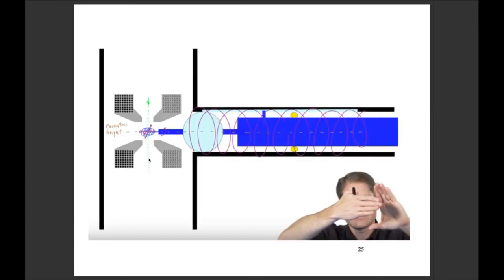Inside of here, he talks about the eucentric height, and that's the height at which, independent of the stage tilt, there is no image shift. The image does not move anymore. And so each sample has a unique eucentric height that can actually vary within the same grid itself. So within the same grid, from square to square, bouncing around this 3 millimeter copper mesh grid, you can have changes of up to something crazy like 200 microns sometimes. That's kind of a function of how flat your grid is.